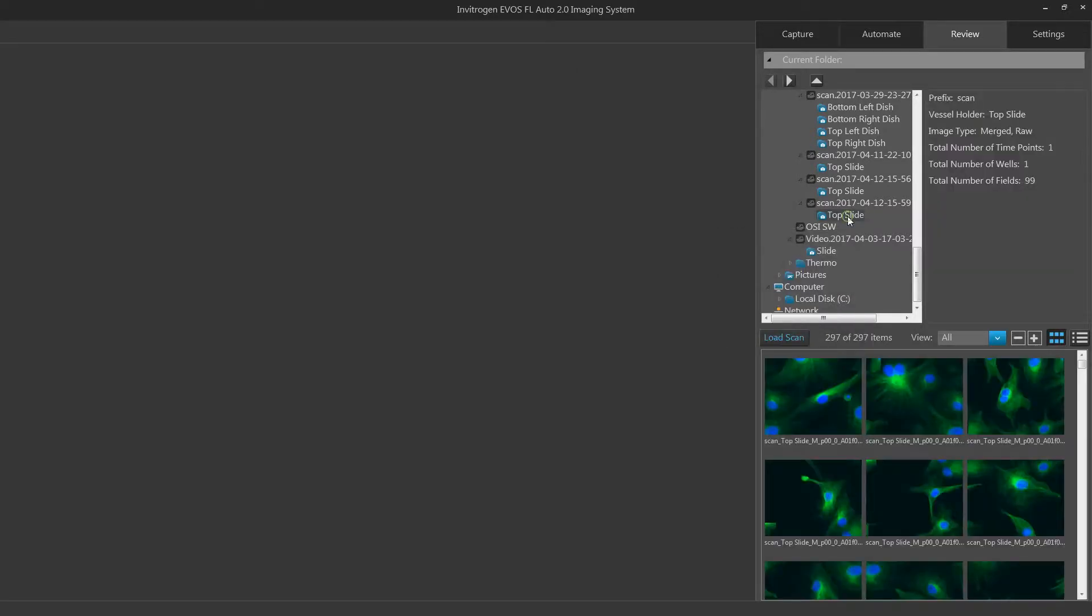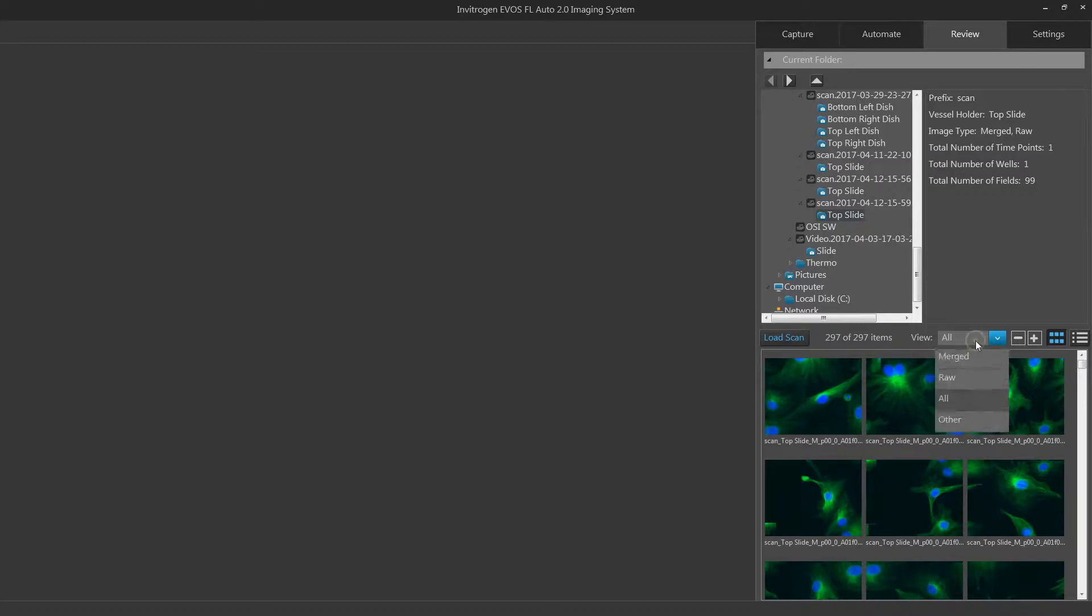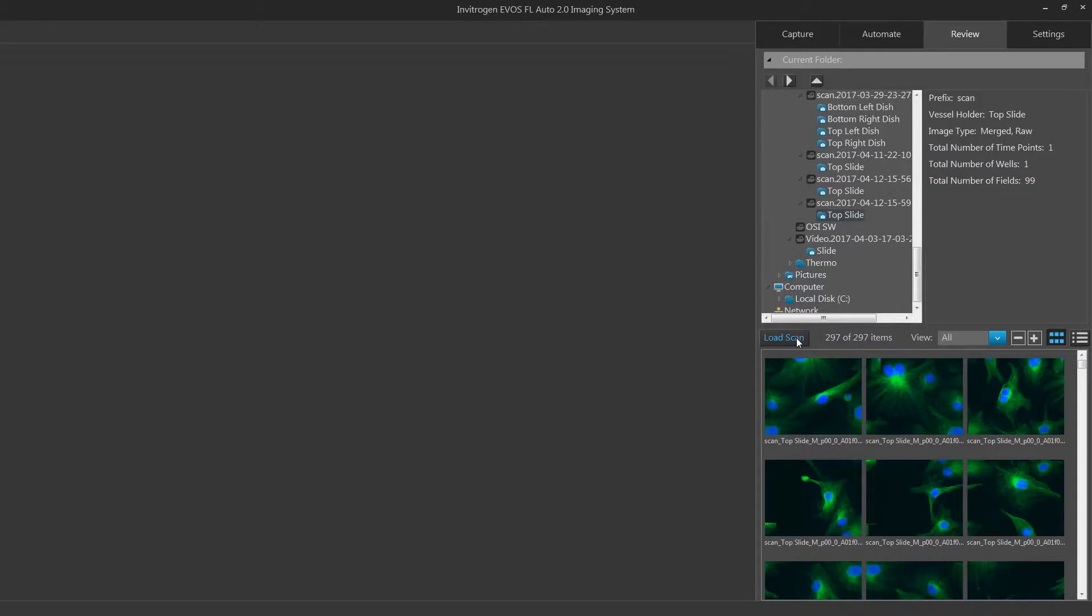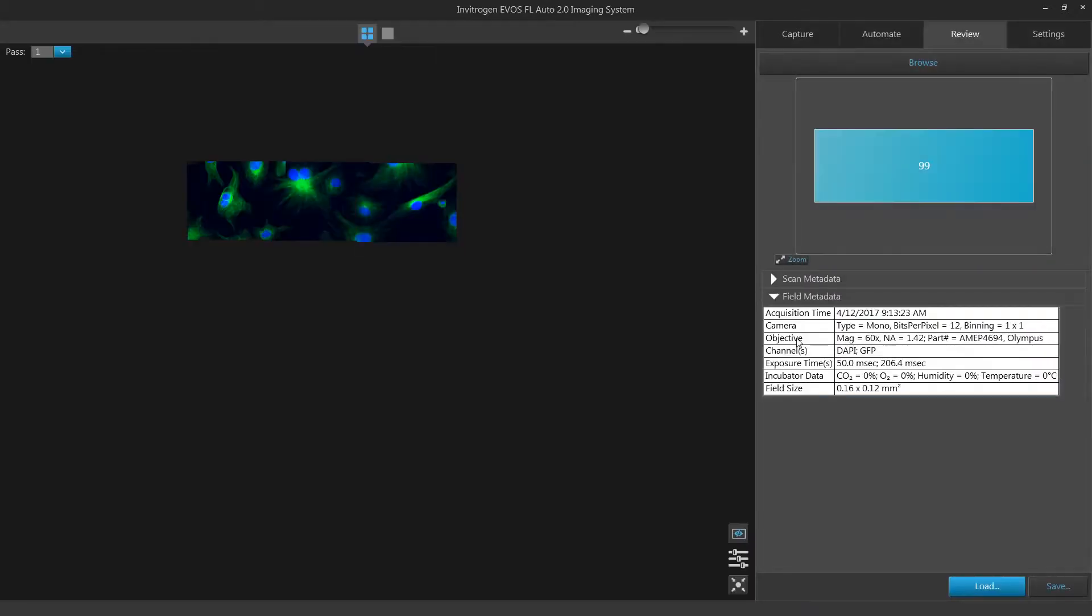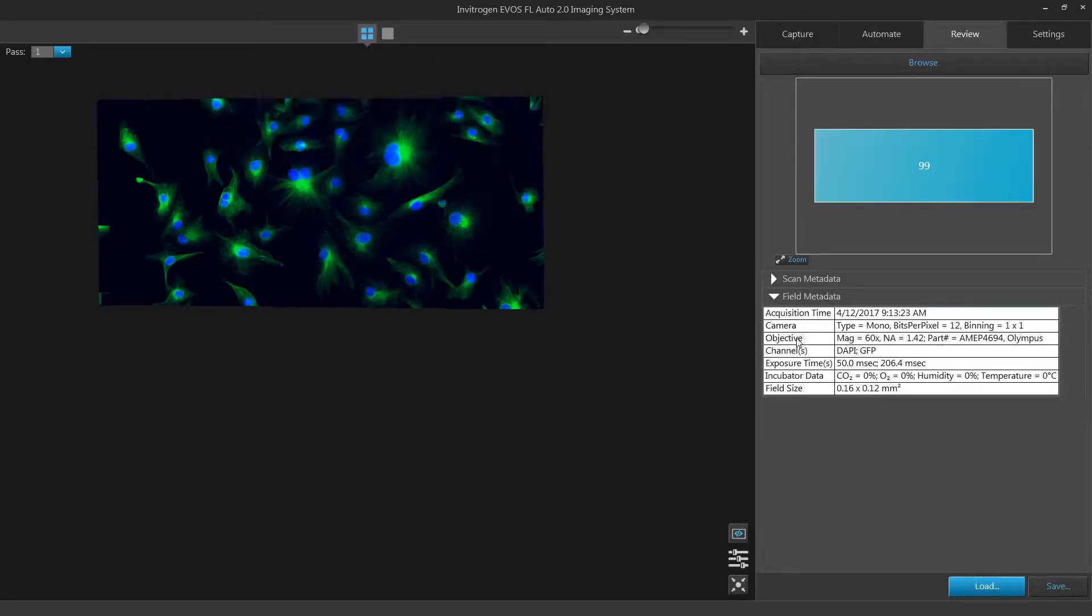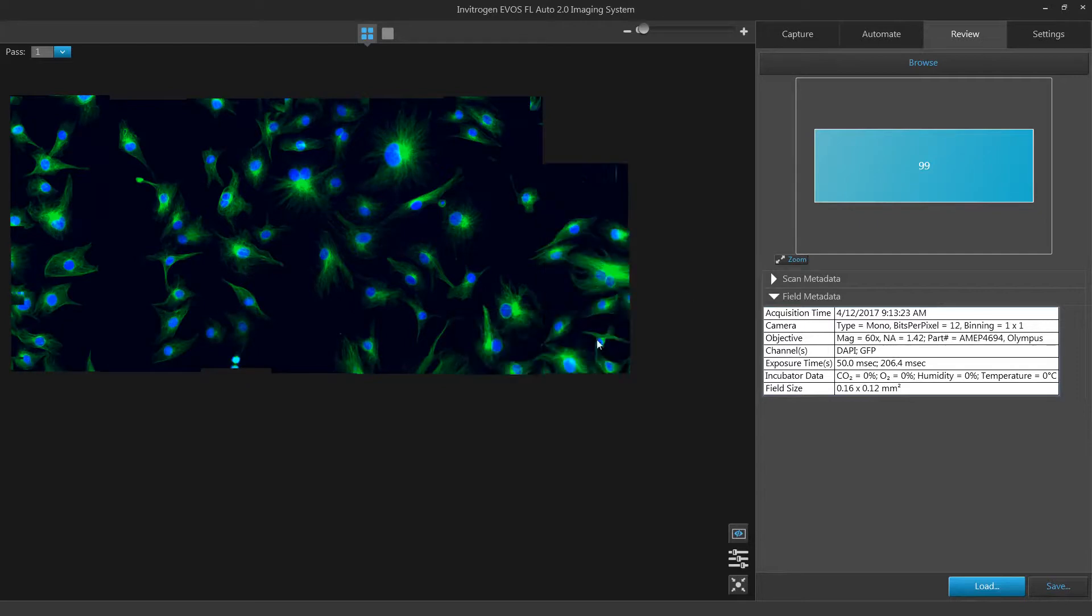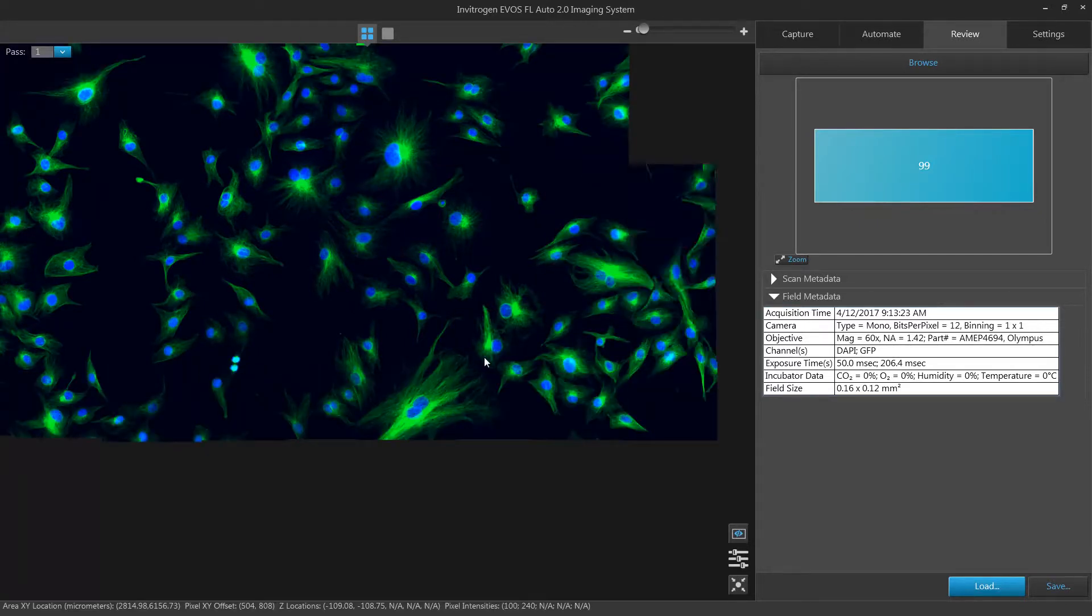When you have found your saved location, select the image subfolder below your saved folder. If you wish to review a specific file type, use the view menu to load a specific file type. Click load scan to load images within this folder into the review tool.